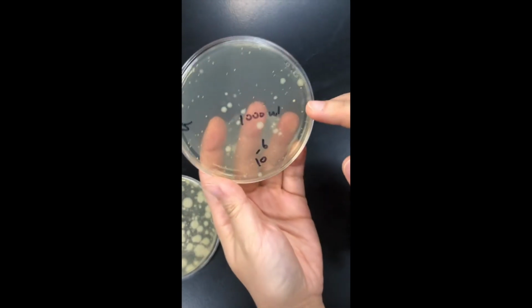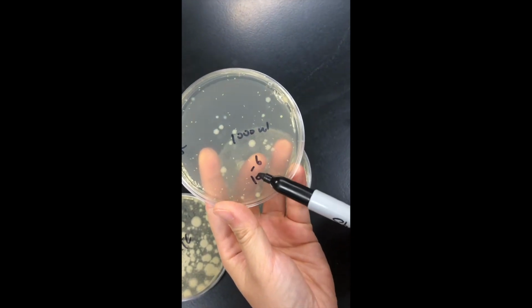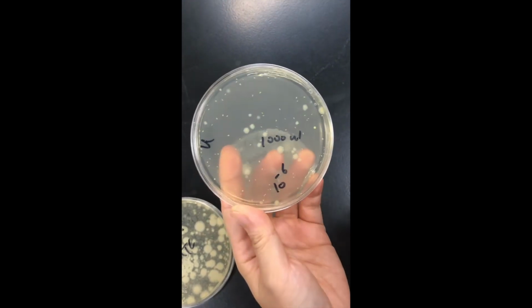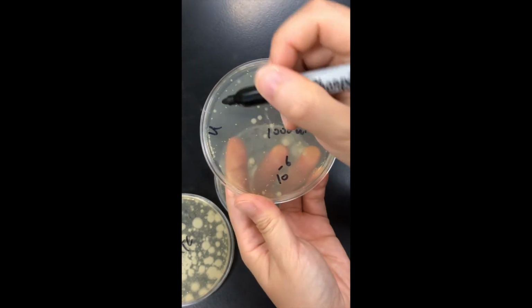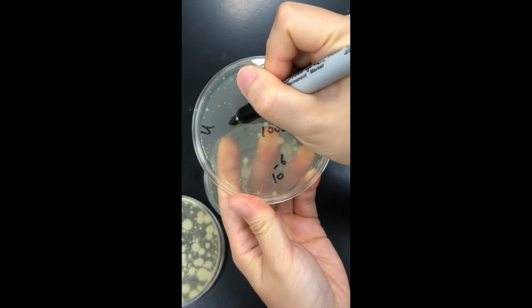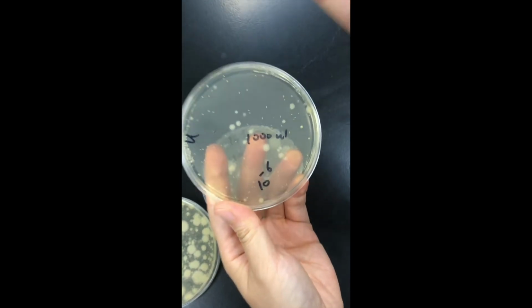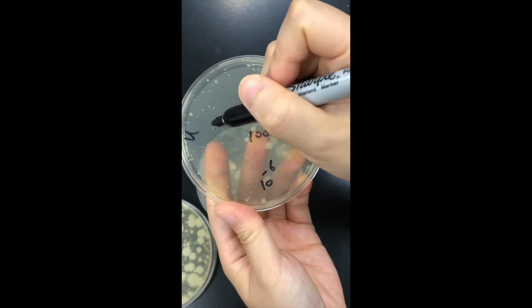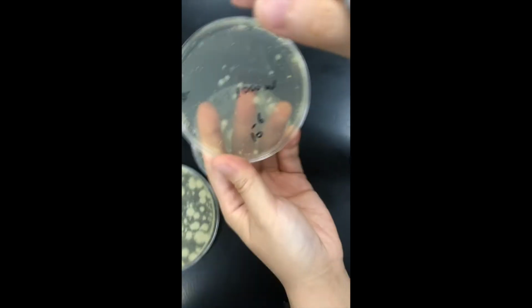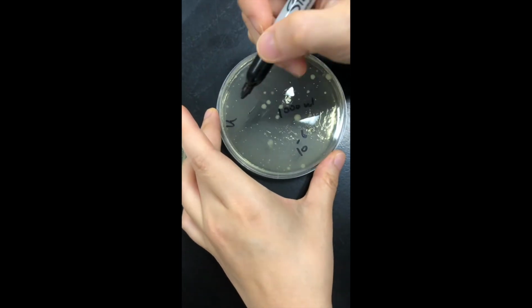How about this one? Well, I think this one is probably okay. I have 10 to the minus 6. How to count the cells is by using a Sharpie marker. When you count one, you mark a dot, so you won't count one colony-forming unit two times. So I'm going to count. After I finish counting, I'll show you the number.